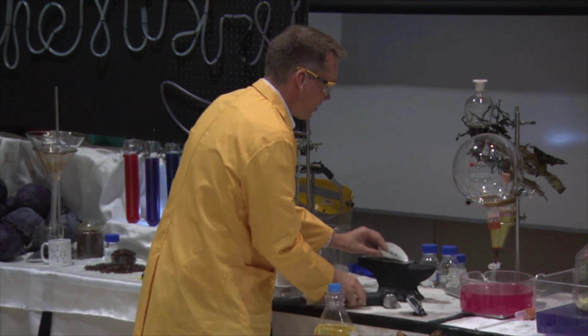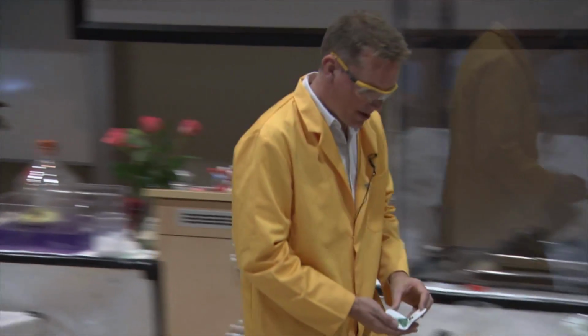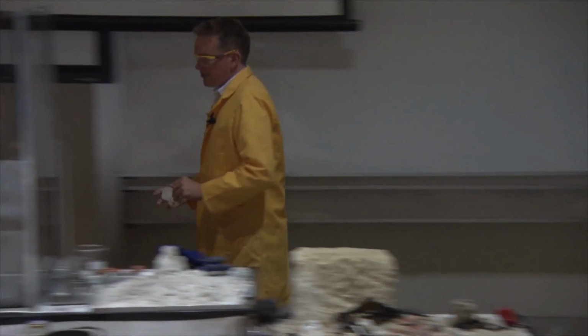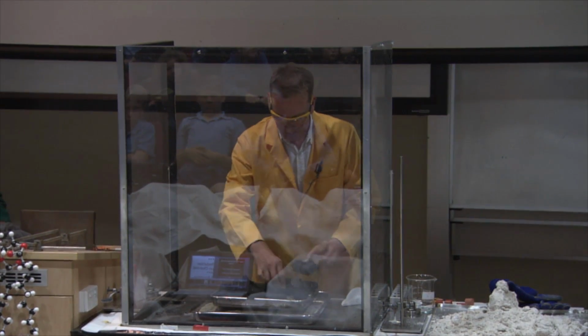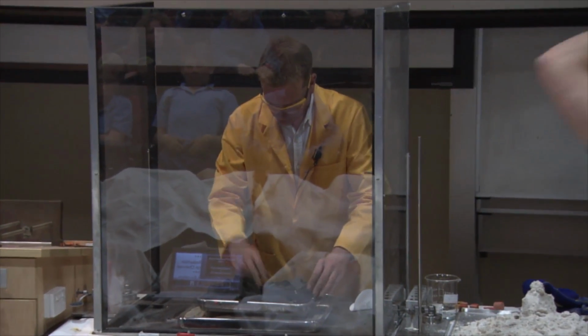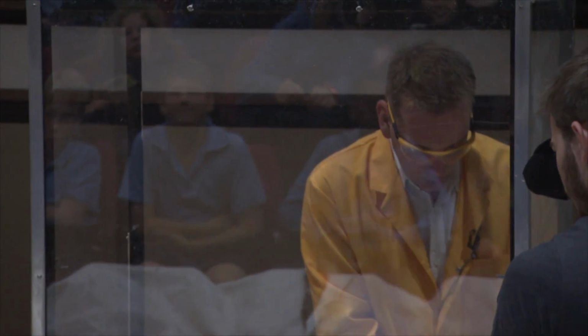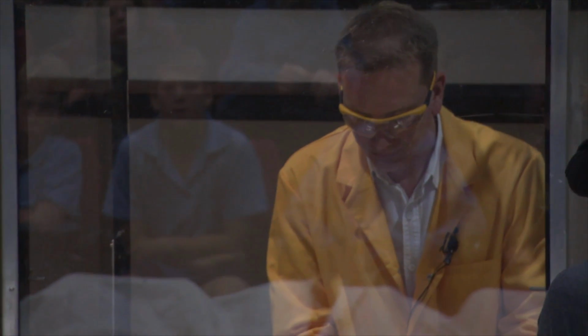That's it, into a nice powder. So I'm just going to take this copper malachite here, this copper mineral. I'm going to put it onto some of the block of charcoal here. Just pick a nice one. Actually, let's use this one. So just going to pour our powdered malachite onto the block.